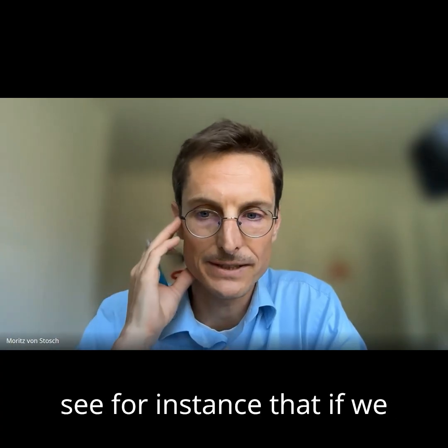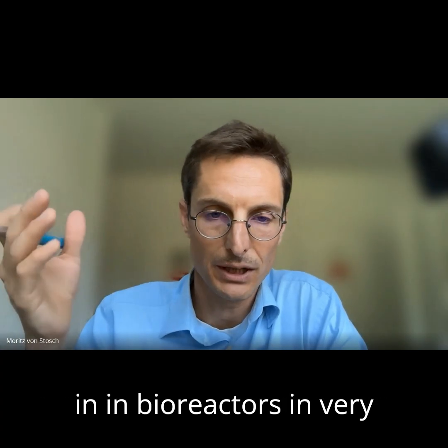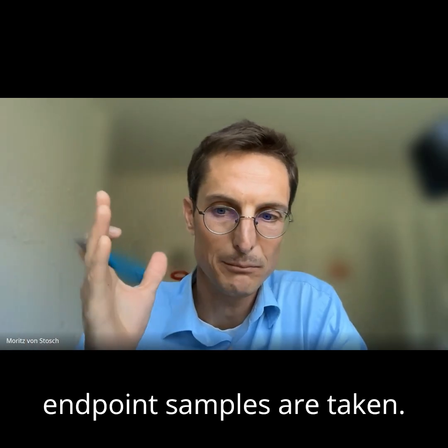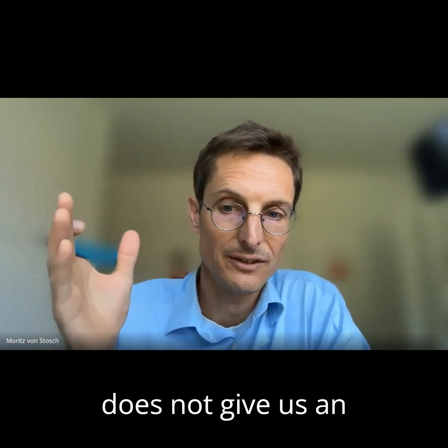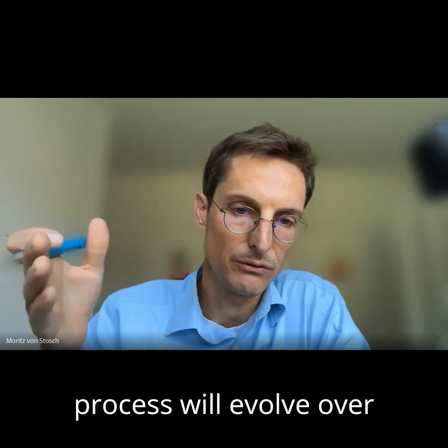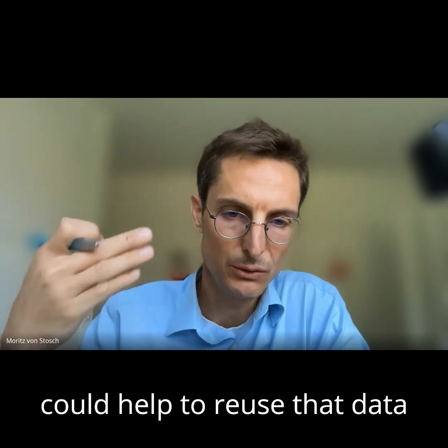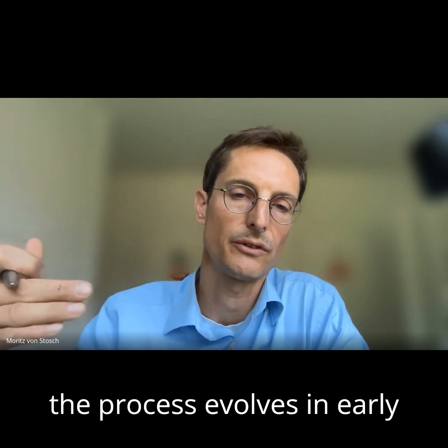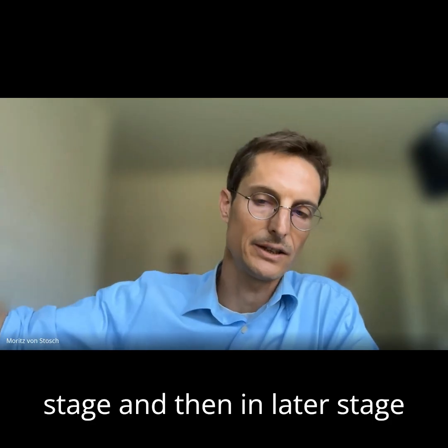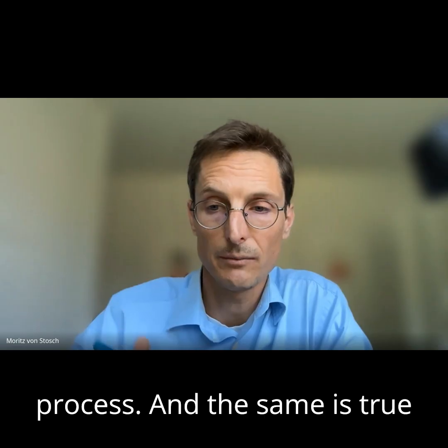And we see, for instance, that if we have shake flask experiments, or experiments in bioreactors in very early stages where only endpoint samples are taken, that might be fine for material screening, but that does not give us an indication of how the process really evolves over time. And so sampling more could help to reuse that data in later stages, because we essentially understand how the process evolves in the early stage, and then in the later stage we can compare the evolution of the early and the late stage process. And the same is true for shake flasks.